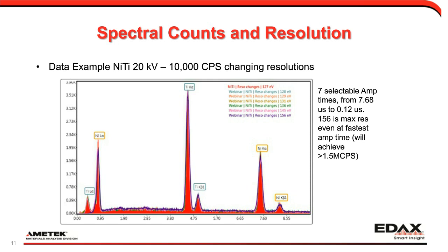So if we think about some of the microscope variables, low kV generates lower count rates and high kV generates higher count rates, that's one illustration. The second way of looking at the microscope impact on count rate is the beam current. The beam current is the number of electrons going through the column of the microscope, and how many of those electrons are hitting the sample themselves.